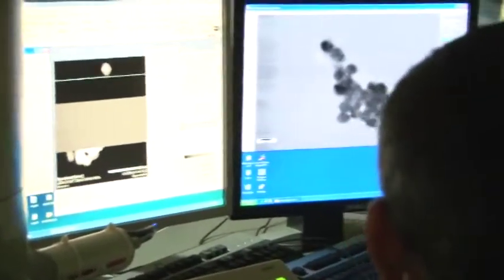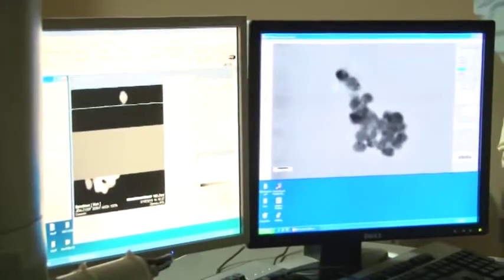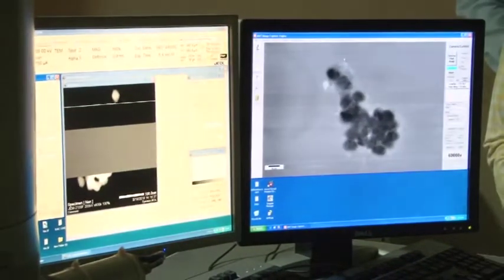So what we learned first is that we will make our objective lens standard, so that we start from some level to align the microscope. So I press this button. It's nothing, it shouldn't be called a step, but it is so important.